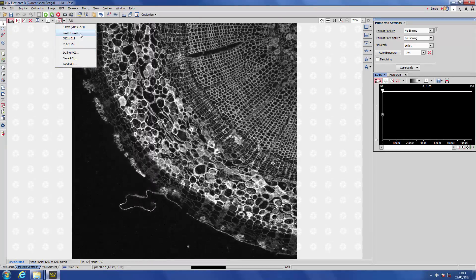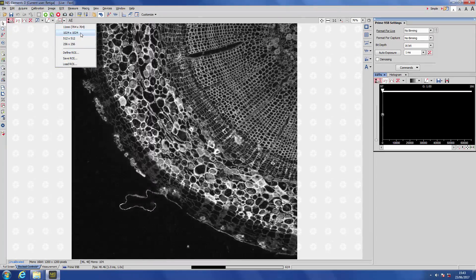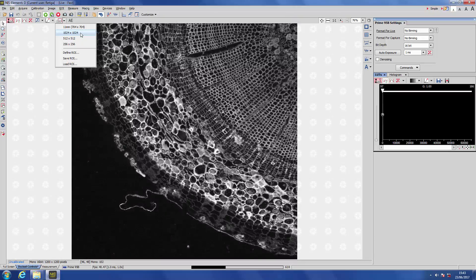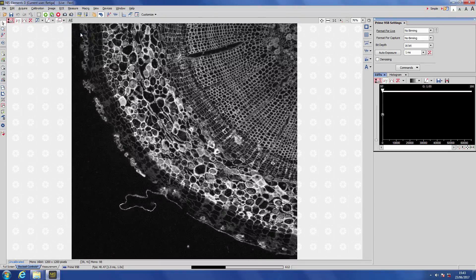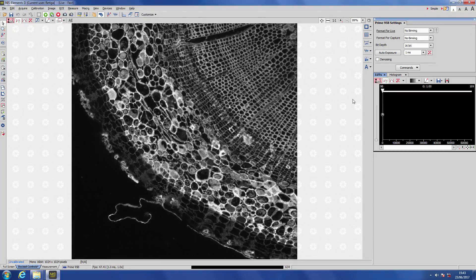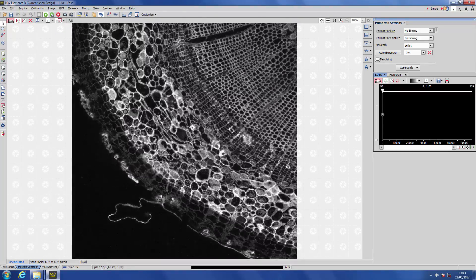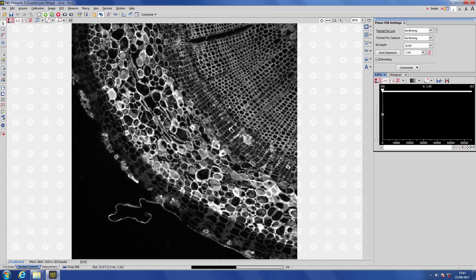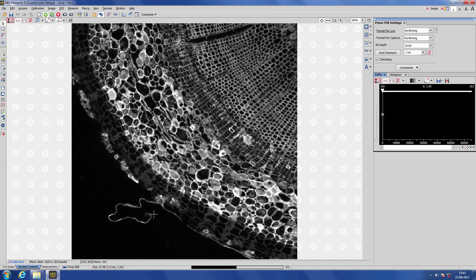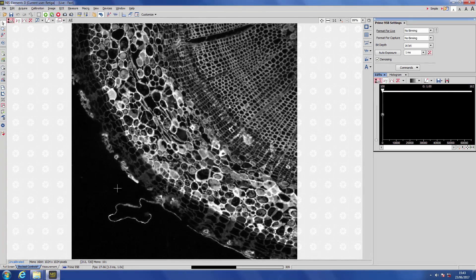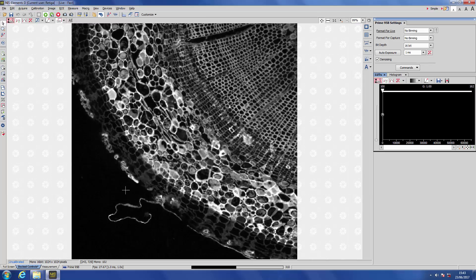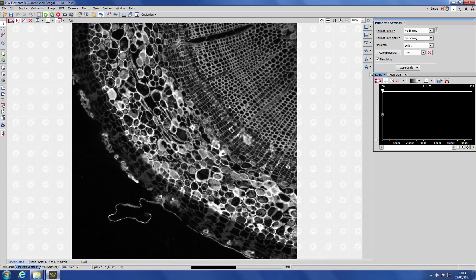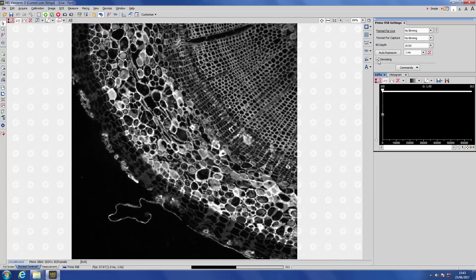So it makes sense to specify this region of interest now, which conveniently is one of the Nikon Elements defaults. And now we go to the Prime 95B settings to activate denoising. And instantly you can see the contrast and the signal quality pop. We get a significant improvement in our signal-to-noise.